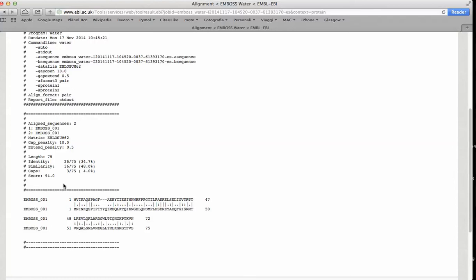In this case, the local alignment rescue the conserved region between the two sequences, because the method searches for region of local similarity and need not include the entire line of the sequences.